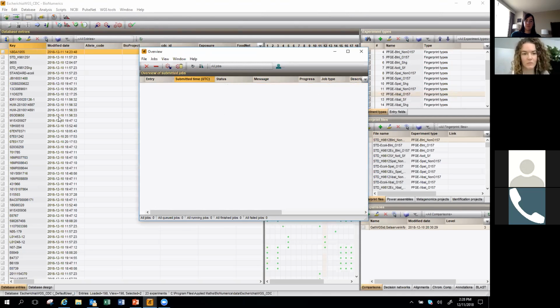It also does additional quality checks that we have standardized here. It's a way to make sure you have good quality data before it goes into your reference database. The biggest thing that we see happen a lot right now is that a lot of laboratories will mix up species. For instance, I'll get something that's supposed to be a Listeria strain, and it turns out to be a Salmonella, but I've analyzed it all through my Listeria database, and now I've created a bunch of allele calls that aren't associated really to anything that it would match to. And then we figure it out through ANI later what it was supposed to be. So this is a way to capture some of those mistakes before they get into your local databases. And it does it pretty quick.